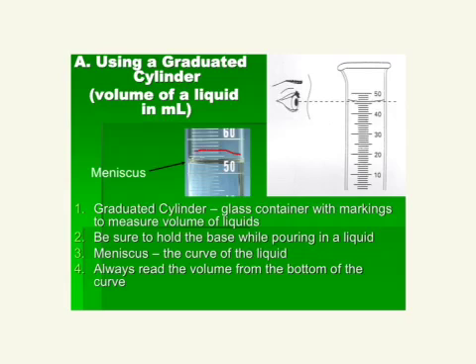This thing right here is called a meniscus. Everyone say that. Meniscus. Now I just randomly heard you speaking out in the middle of my class. That's kind of funny. Say it again. Meniscus. All right. It's the skin of the water, and it's the curve of the liquid. You'll see when you're looking at it, in this picture especially, it looks kind of thick, like a skin on the water, like on gravy or something.